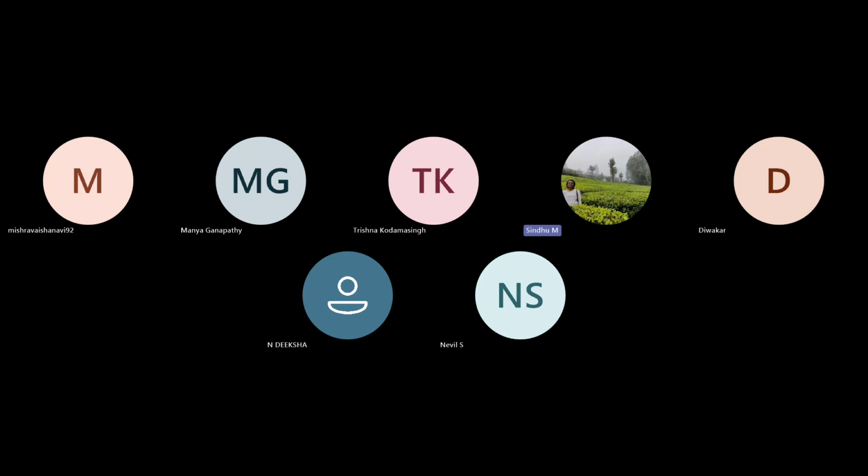So again, time-lapse images, when you open in FIJI, or the microscopy data that you get, will not open as a stack. The microscope will acquire one image per time point, so it will be saved as separate images. I'll just save it as separate images.